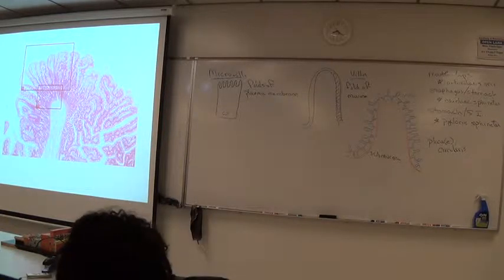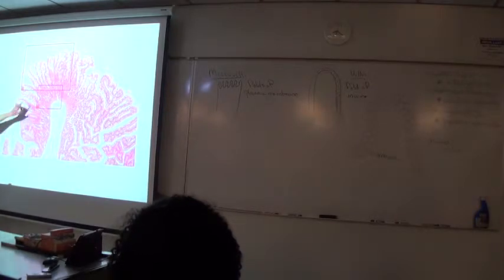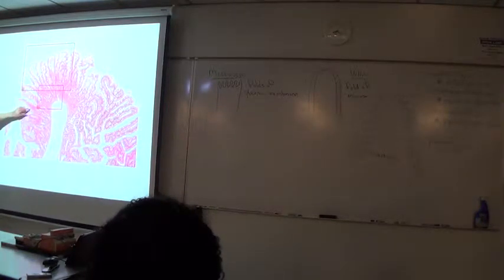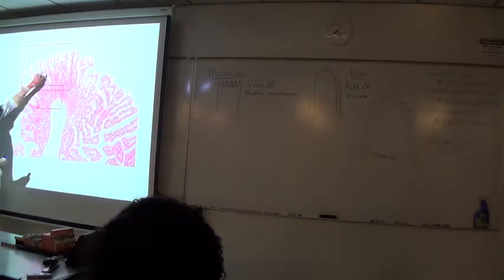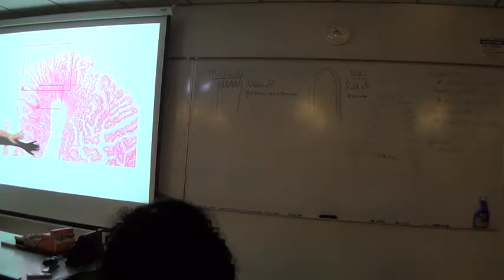So now on the screen, these are individual villi. In fact, right here, you can see a wide space channel within the villus. That's the lacteal. Here would be the surface epithelium, columnar epithelium with goblet cells, right? This is an extremely wide lacteal in there. So this is similar to what I just drew on the board.